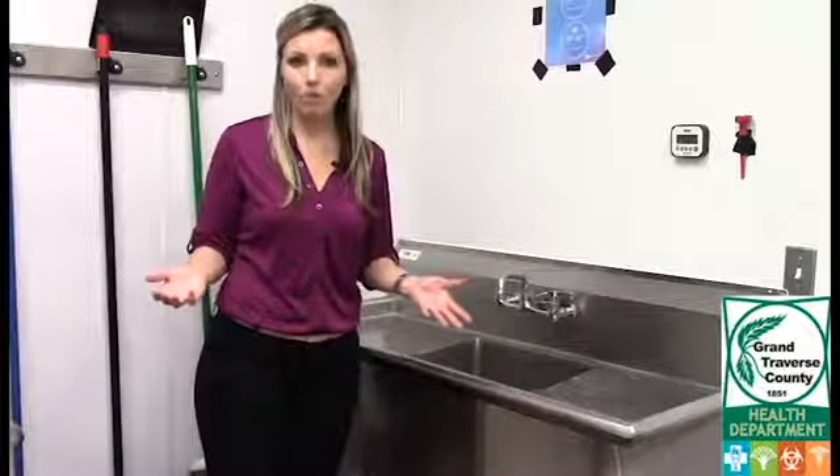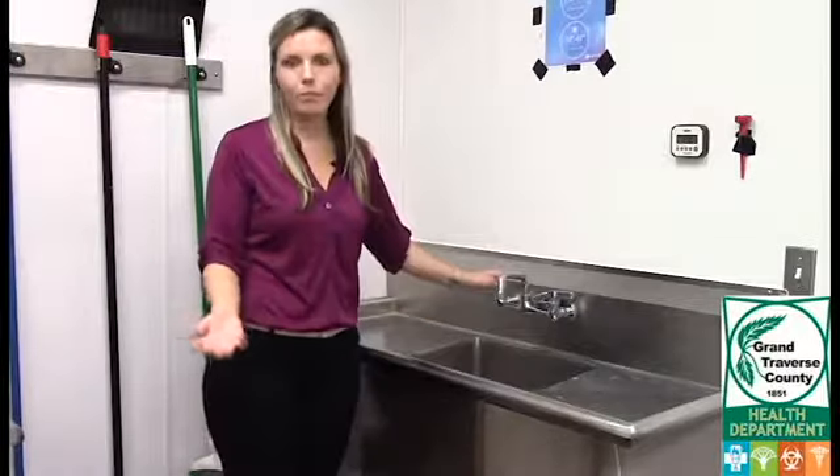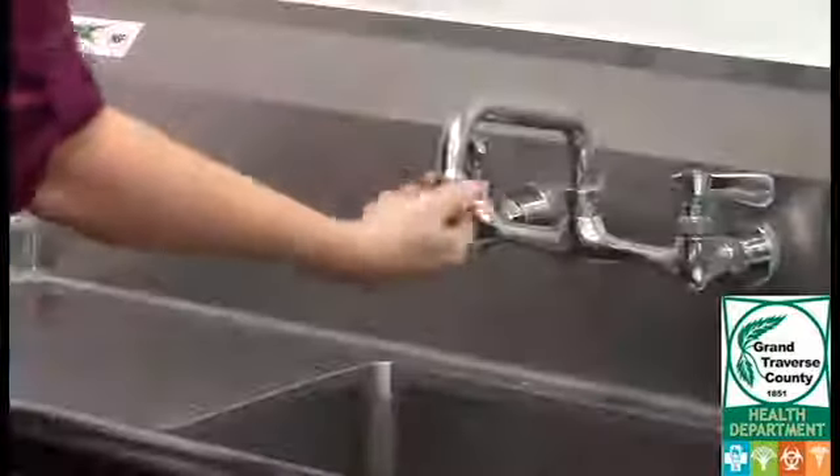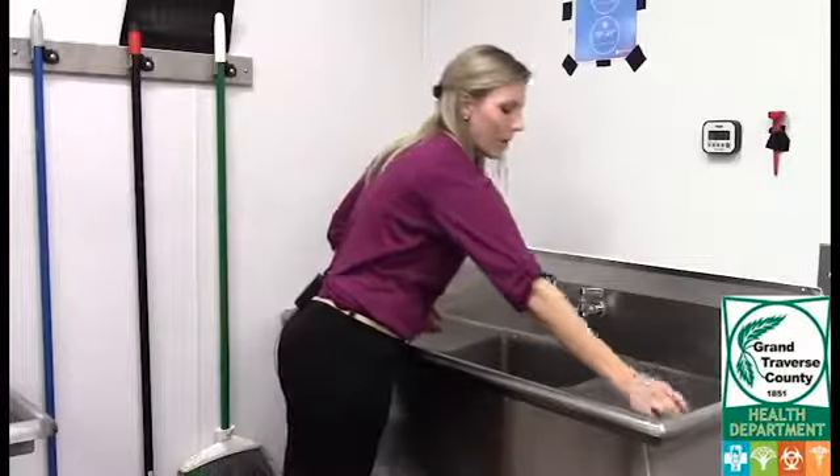First you're going to choose your tap — it can be any number of water sources at your establishment, but preferably one that's used more often than others. Now that you've chosen your tap, you're going to want to remove the aerator if it has one. Just pick it up and put it off to the side for now.